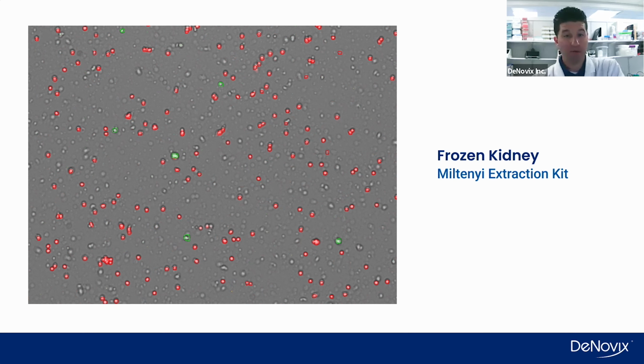Similarly, we did a frozen kidney, and this was using the Miltenyi GentleMax system and their extraction buffers. You see a very similar level of debris. Again, I don't think this is too much debris to move on. And this level of the nuclei are mostly single.